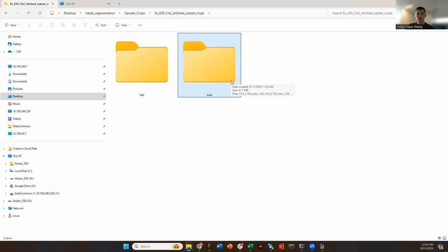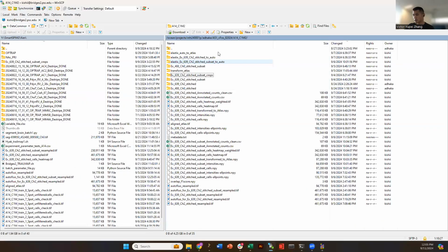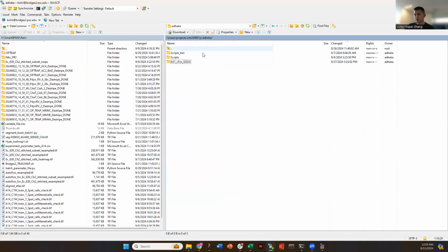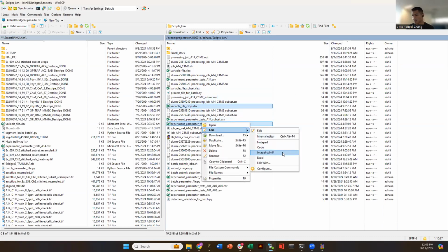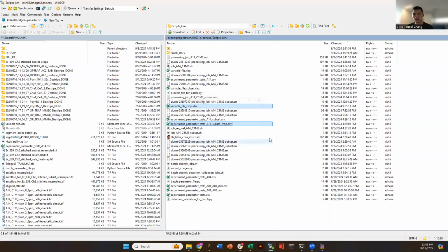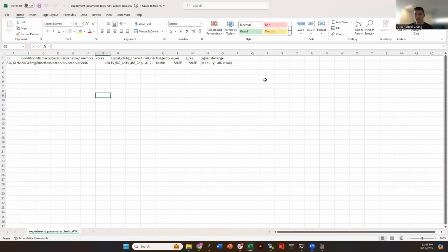Okay. So this means, to do this, I would be in my variable file Excel sheet, and I would set detection flag as false, so I don't generate the detection flags, but I'll keep crop flag as true, and then I'll set a test proportion of some value to get the test files, and then I'll have the train files, which will be the number of n crops that I set. Is that correct? Exactly.